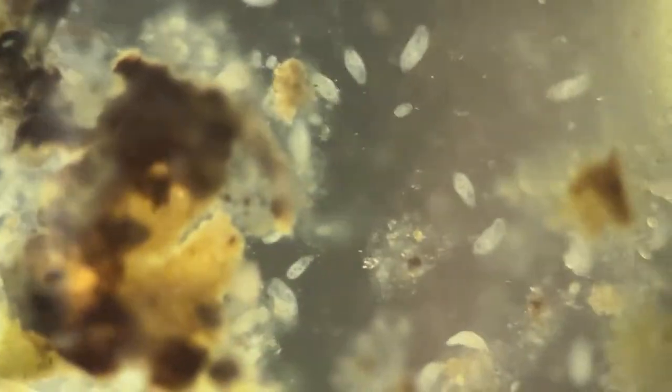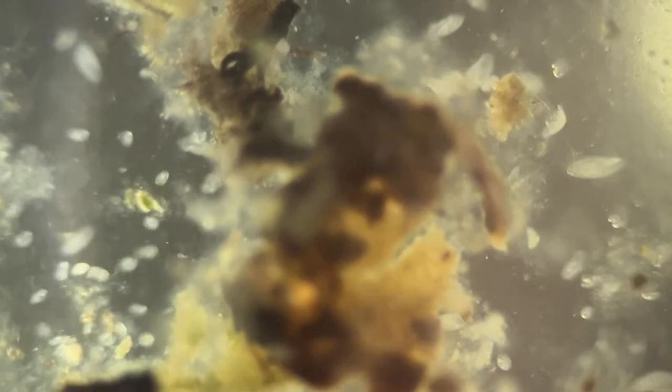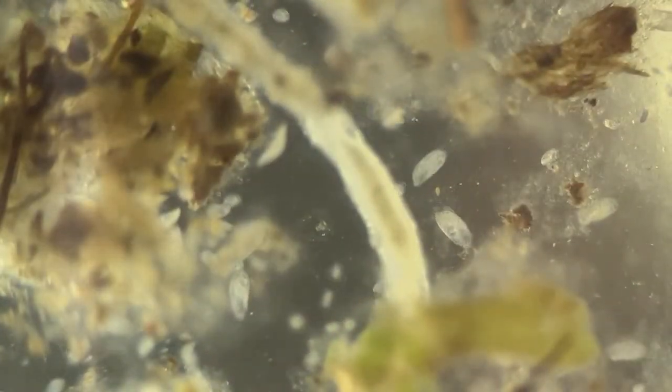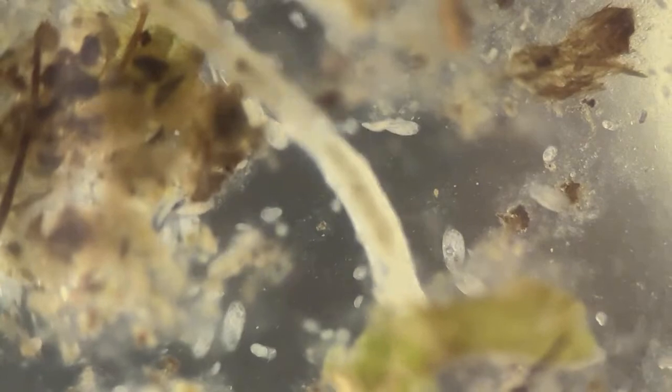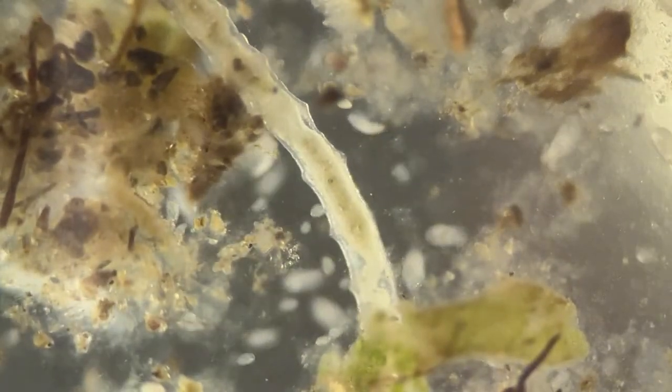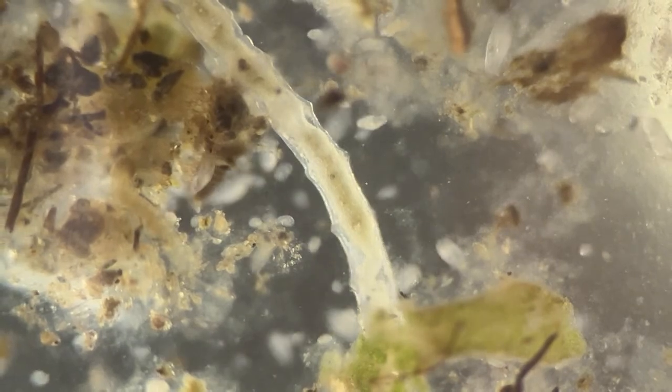I need to move the camera a bit more. Well, I'll do that later. Now look at this. Isn't this much more appreciable to look at? There is this little worm. You can see the movement of the body organelles in that worm.